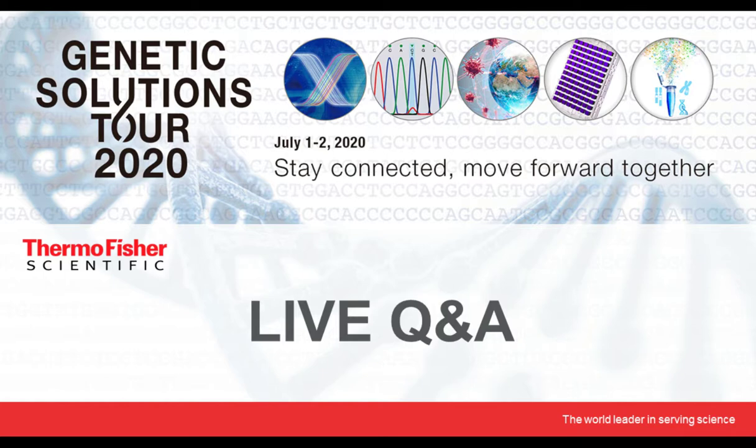You could, but I don't think there is a way to really use two different ways in the same set of experiments together. It might be difficult to do. I'm not aware of any analysis software which will help you do that, but you can definitely do it two ways.